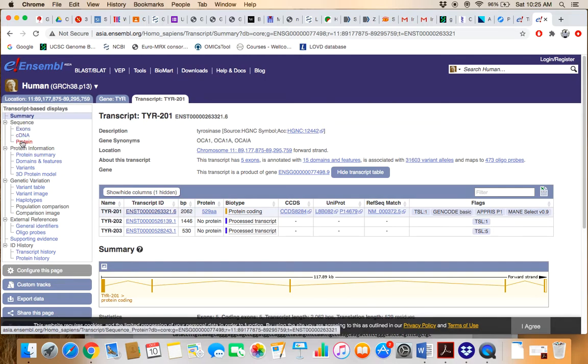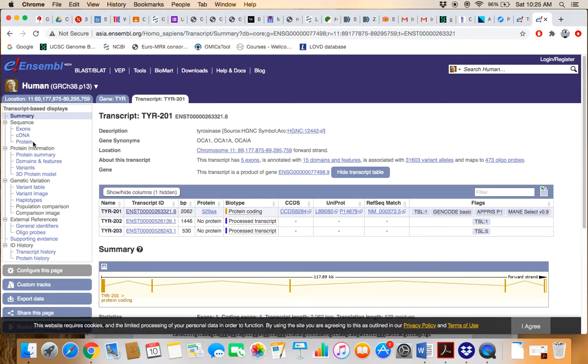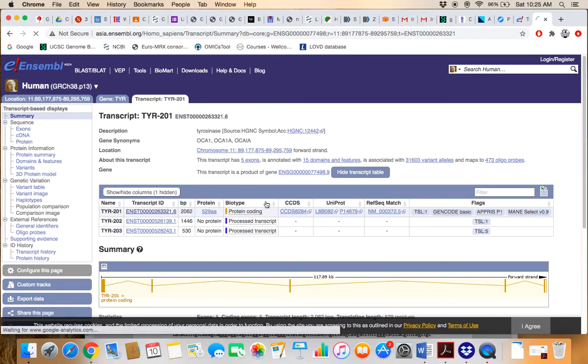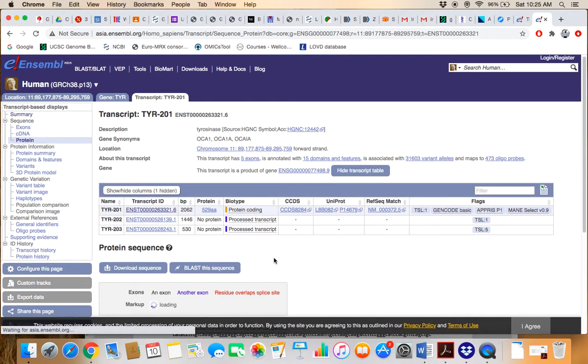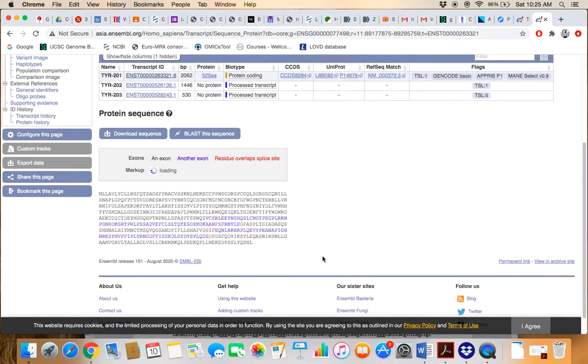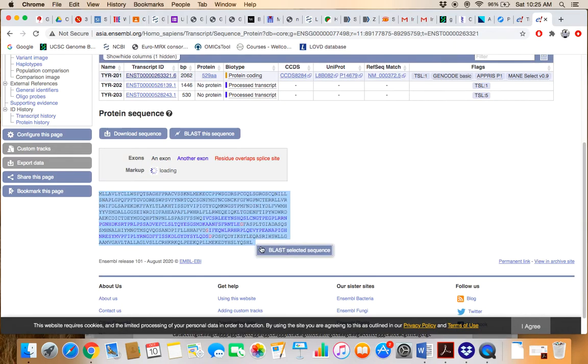If you want to retrieve the sequence, scroll down on the same page. Here is the protein sequence - the protein sequence is TYR.